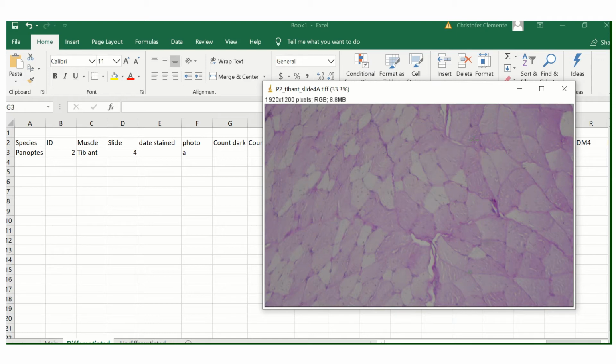In some cases you might not be able to. You can see the difference between a dark and a medium here and a light. When they're all next to each other, it's quite easy. Sometimes it's difficult. If you find it too hard, don't worry about differentiating between dark and medium. Just call them all medium. But it'd be really cool to be able to differentiate between them.